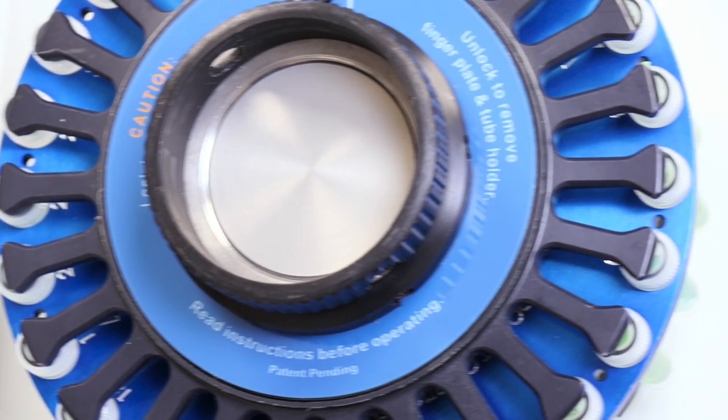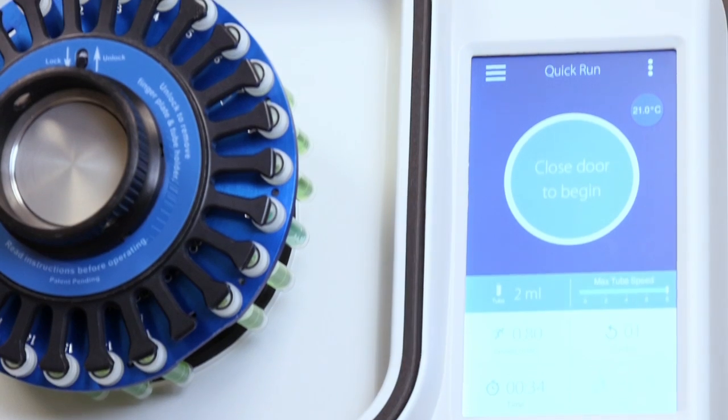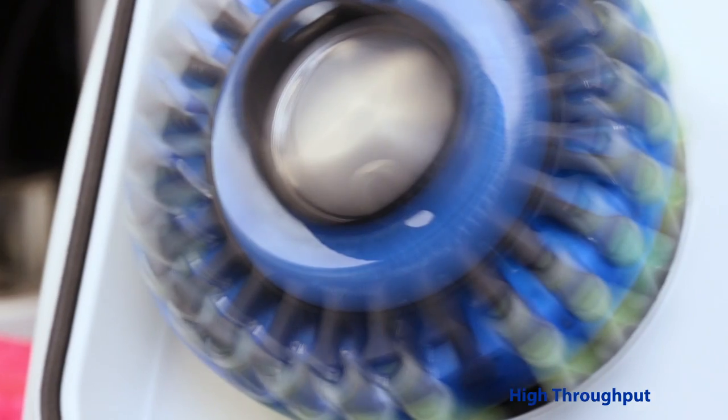The Omni Bead Ruptor Elite Bead Mill Homogenizer is the most advanced and powerful bead mill available. It is specifically designed for laboratories requiring high throughput sample disruption.